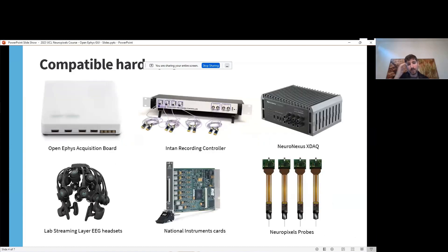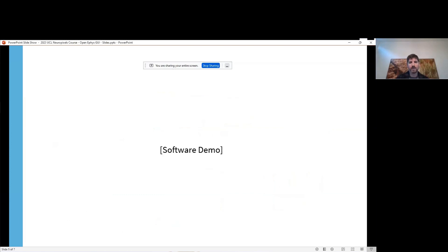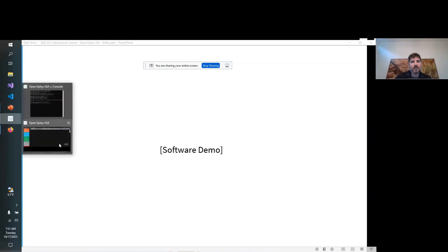The GUI can currently acquire signals from the OpenEphys acquisition board, Intan recording controllers, XDAQ systems sold by Neuronexus, lab streaming layer compatible EEG headsets, and most National Instruments DAQ cards. But today I'm going to demo features of the software relevant for Neuropixels recordings. I've got a quick software demo to show.